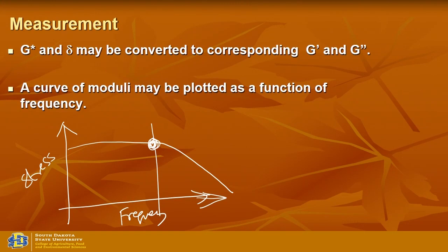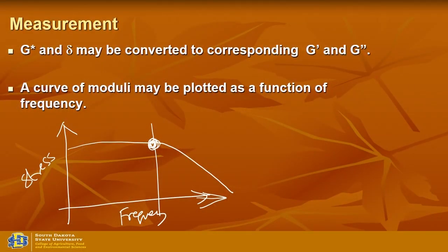So this is the one we have to do in the beginning, before you even try to do other tests, amplitude frequency test or frequency sweep or temperature sweep, whatever you want to do. This absolutely needs to be done for your sample, so that you can fix the stress value in the linear viscoelastic region.